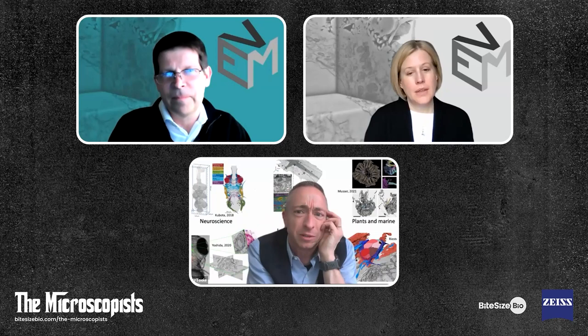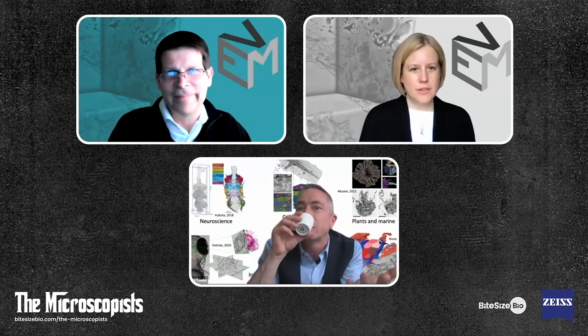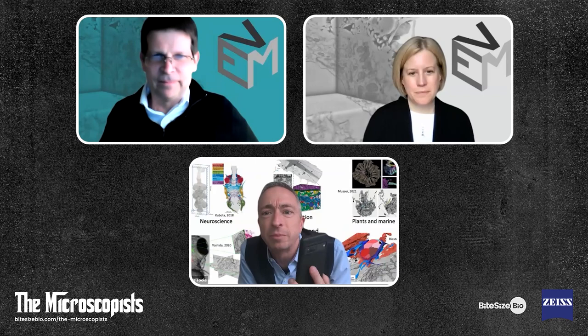How much do the digital cameras cost? Well, digital cameras or detectors, depending on which. Okay. So if you're using TEM, you're using a digital camera, which is costing... Kirk? They can be 80,000, 100,000, a couple hundred thousand, depending on the sensitivity of these systems. They can be expensive. Or you can get one that's good enough for a bit less than that, but it's normally in tens of thousands of range.